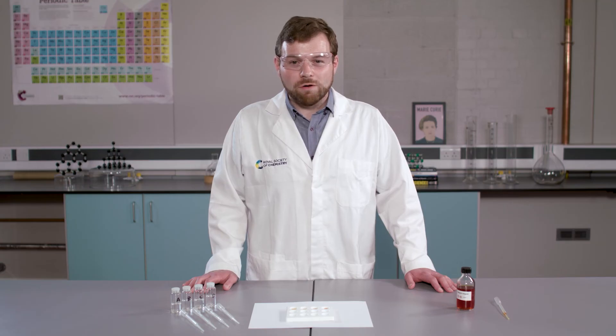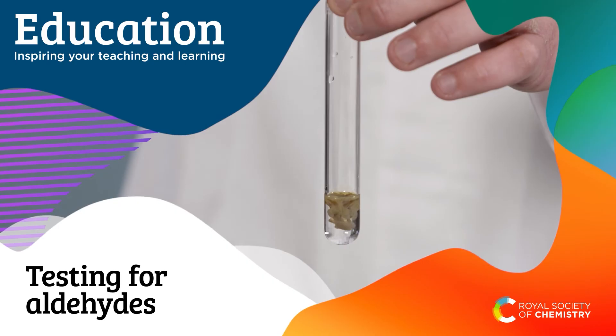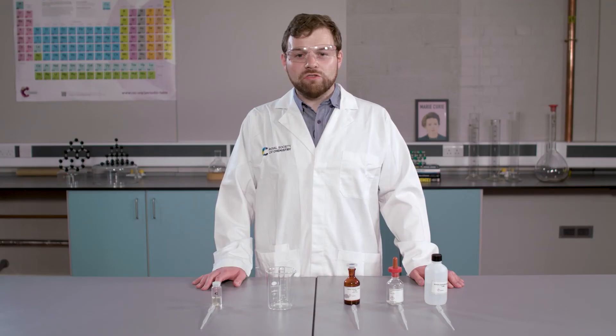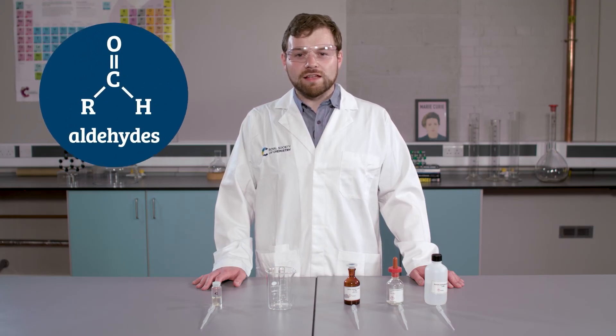I am now going to show you another test for aldehydes. This test uses Tollens reagent which contains silver ions. When added to aldehydes, the silver ions in Tollens reagents are reduced to silver atoms. This test is sometimes called the silver mirror test, and you will see why. I am going to make and use Tollens reagents in situ. This is because if left to stand, explosive silver compounds could form. As you can imagine, I am also going to be doing this experiment on a small scale.